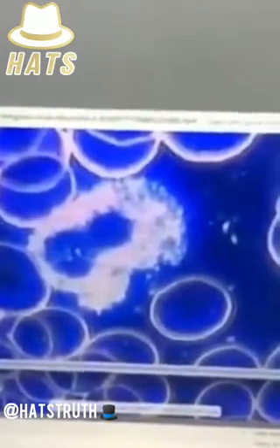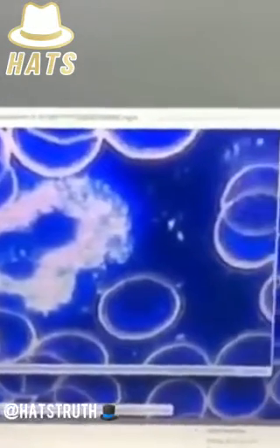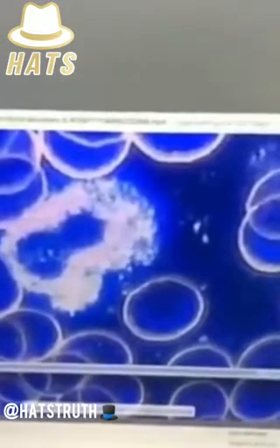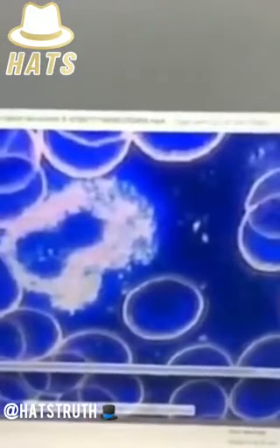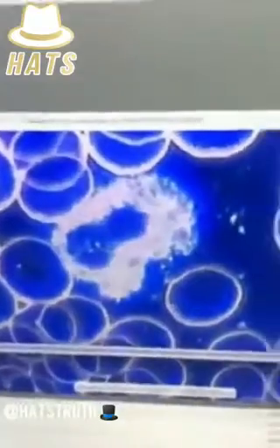I would say this is a cell that reacts to something toxic or wants to defend itself. I have never seen a white blood cell like this. I thought, wow, what's this? Why is this so aggressively working? You could say if an autoimmune activity or something goes on, the cells are attacking something very strong. So it was not a normal white blood cell that we saw here.